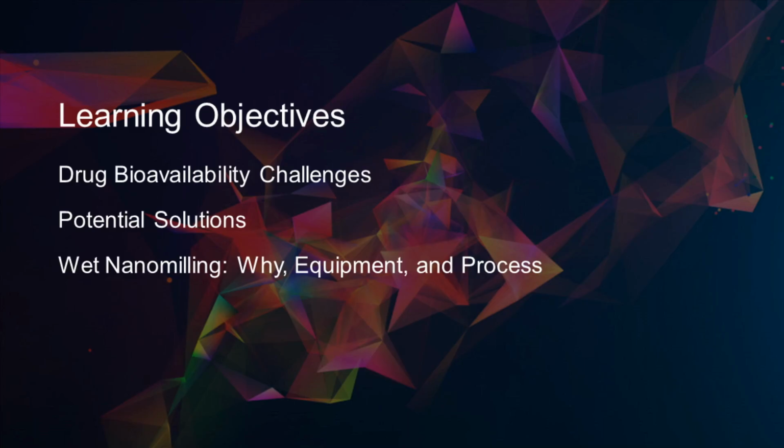So some of the objectives that we have for today is to discuss the drug bioavailability challenges, potential solutions, wet nanomilling, why, the equipment that we use, and the process that we use for it.